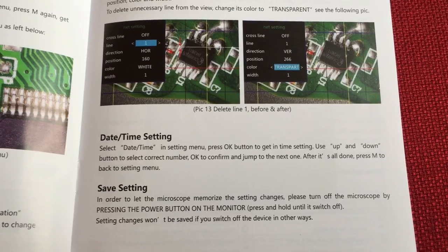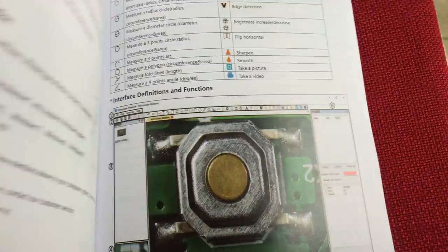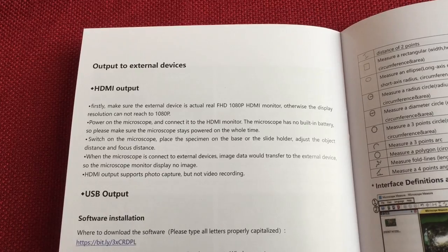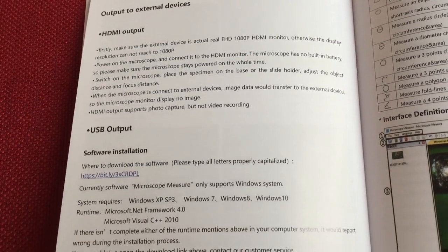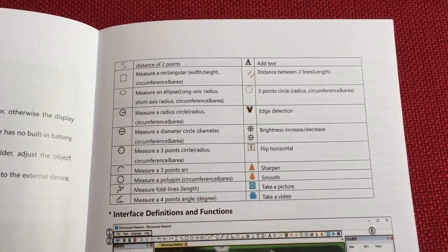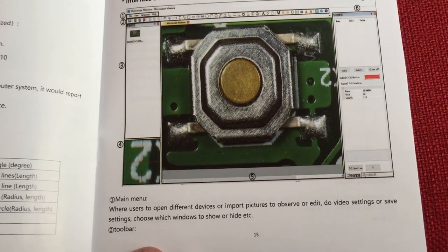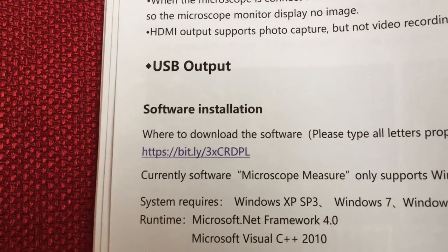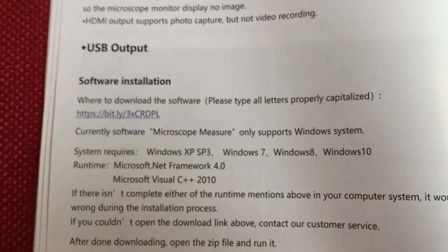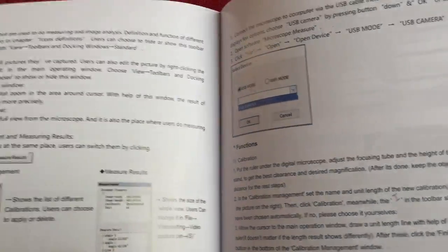When you save a setting, you turn off the monitor power and switch it back on. The menu also has HDMI output settings. The PC measurement software does a ton of stuff and the download link is in the manual. It supports Windows XP through Windows 10. The software covers calibration and measurement of specimens.